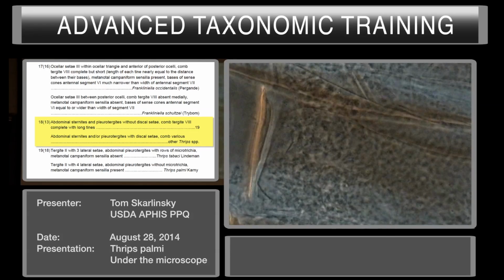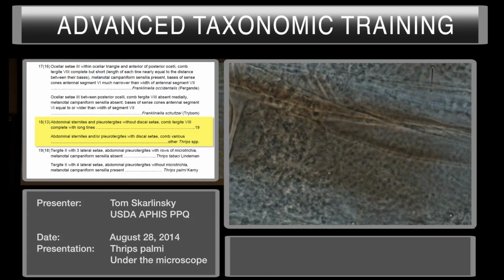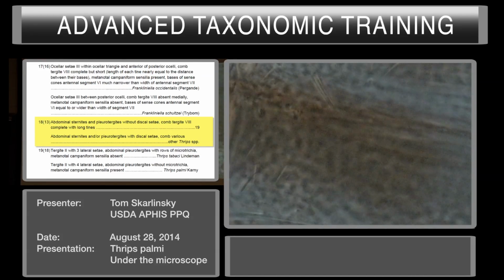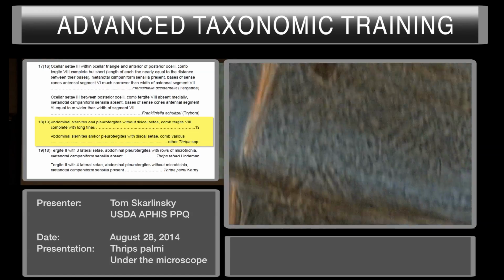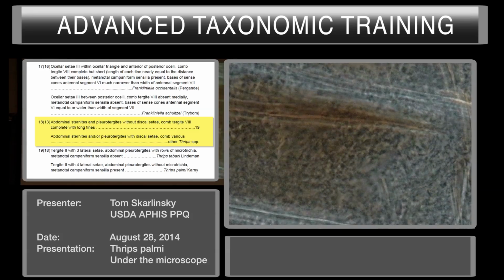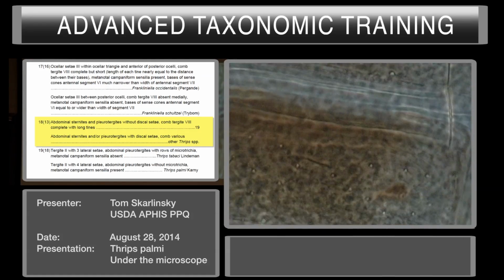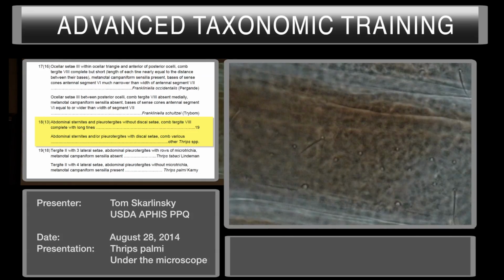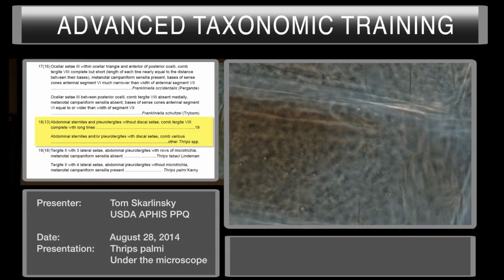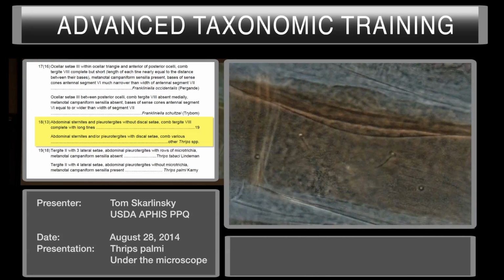Let's move our focal plane to the ventral side. Actually, in this specimen, I'm going to go ahead and get another specimen that we can show you that.